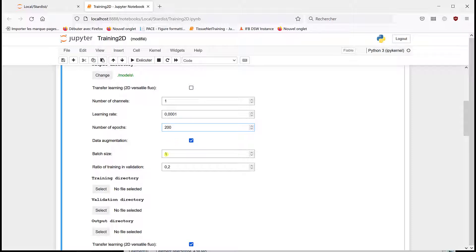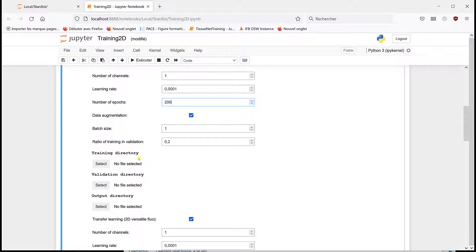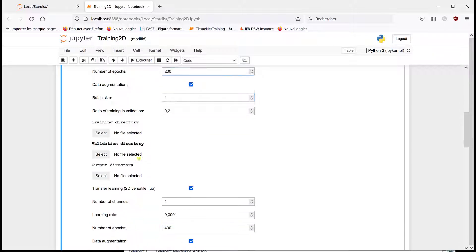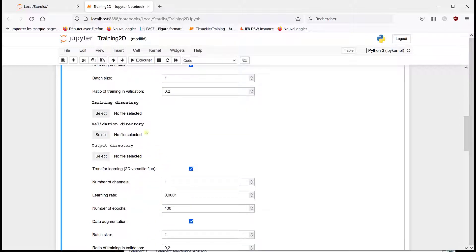Here, batch size, we're going to keep it small so it can run on any computer. We could, if you have a GPU with a little memory, you can increase that.